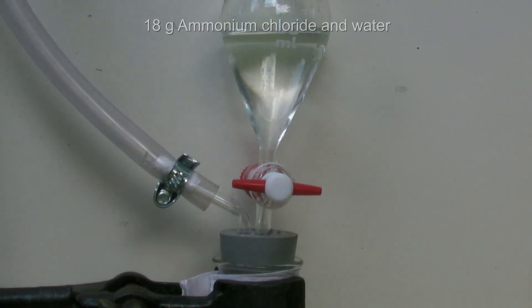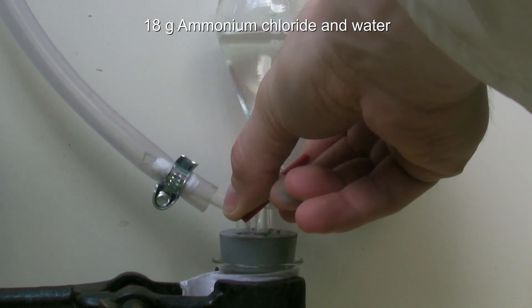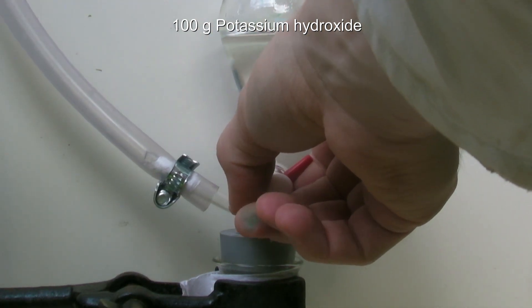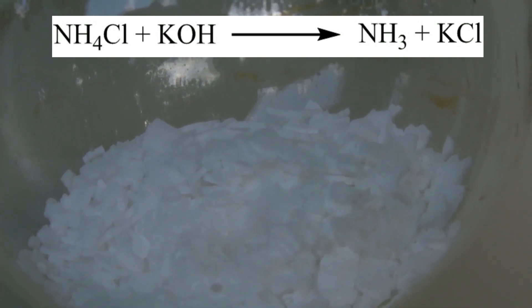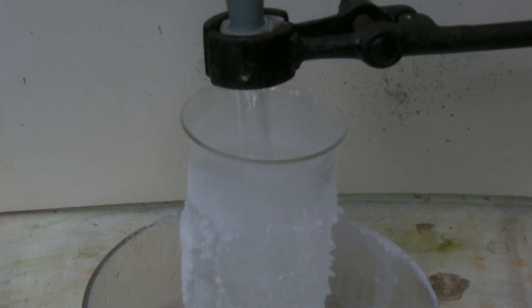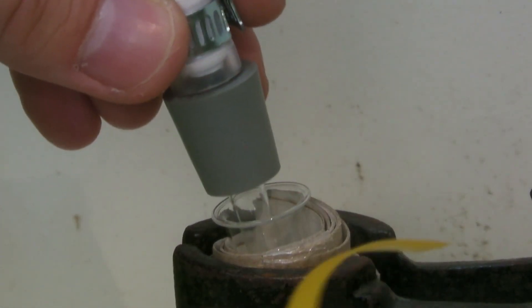To the dripping funnel, a saturated solution of 18g of ammonium chloride in water is added. This is added dropwise to 100g of potassium hydroxide. The ammonium chloride reacts with potassium hydroxide to form ammonia gas and potassium chloride. Then the test tube is held into the cooling mixture. With a wet pH paper the presence of ammonia gas can be tested.